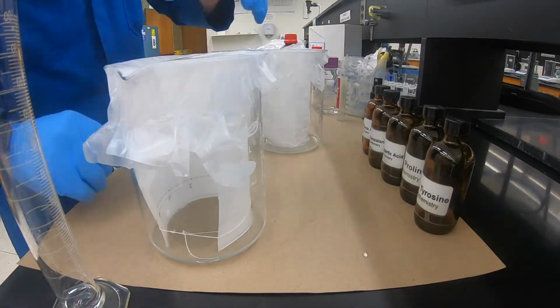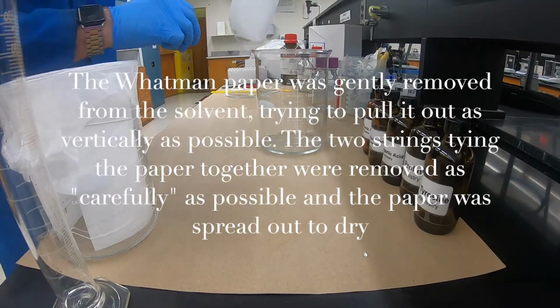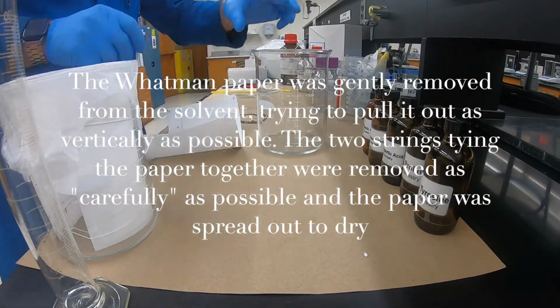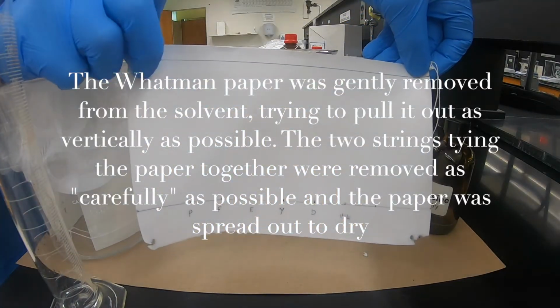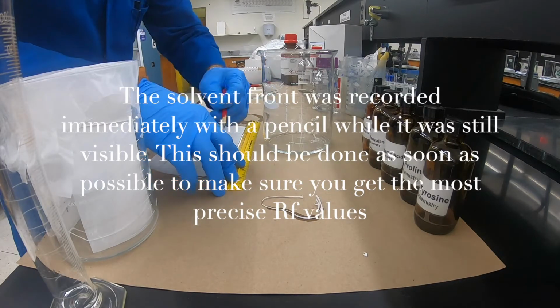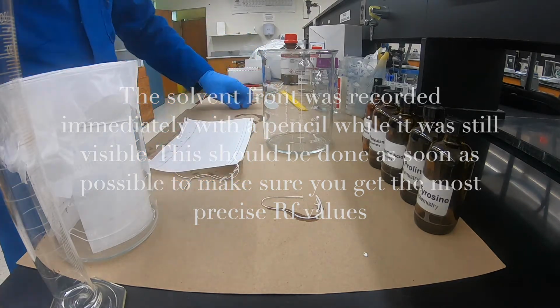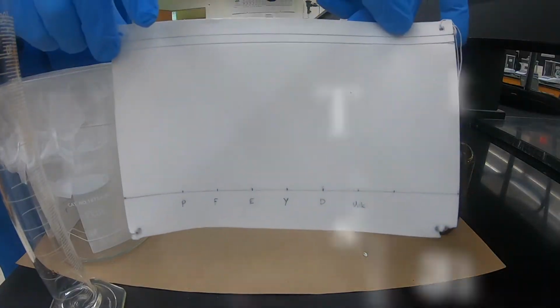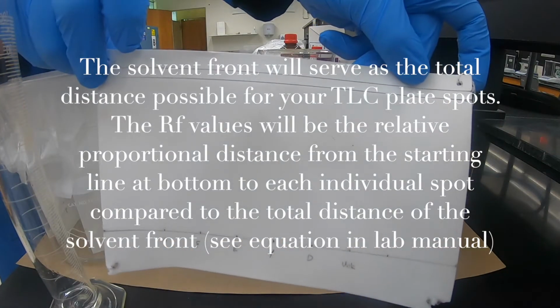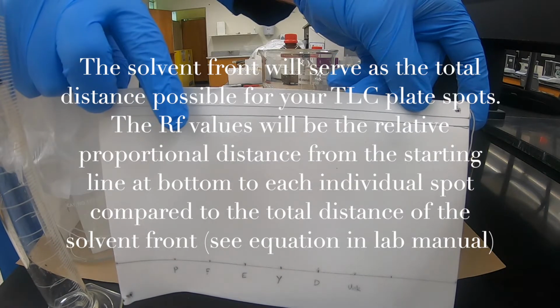Once the time is up, we pull out the Whatman TLC paper and we lay it out to dry. Try to keep it as flat as possible and not damage it too much. The solvent front, we immediately record. We should do it as soon as possible to avoid losing where the solvent front ends. We've already talked about what the solvent front is. You want it to be as clear as possible for your measurements and calculations later.